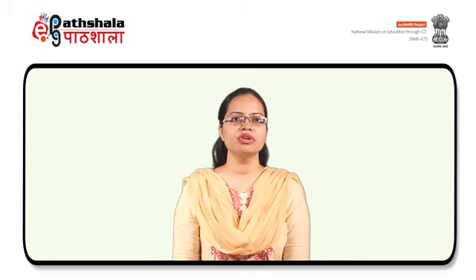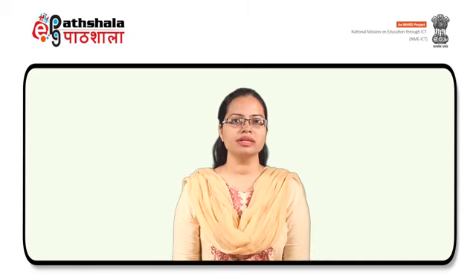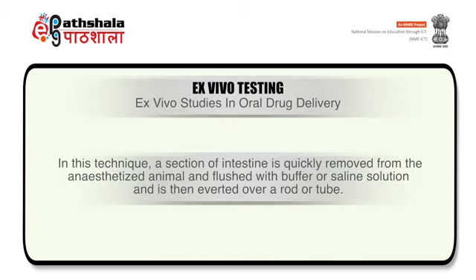Another technique for the ex vivo testing in oral drug delivery is the everted gut sac technique. The everted gut sac technique was first introduced to study the absorption of compounds along the intestine of rat and golden hamster. However, now it has been explored for the investigation of mechanism and kinetics of drug absorption, prodrug conversion in the GI segments, efflux transport, multi-drug resistance, drug interaction, and also to measure the mucoadhesive properties, transport, and cellular uptake of nanoparticles.